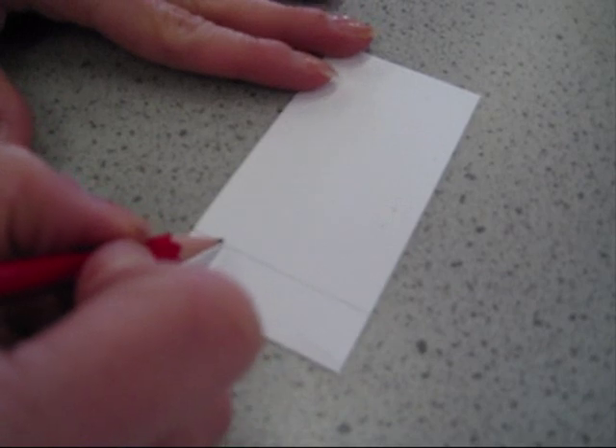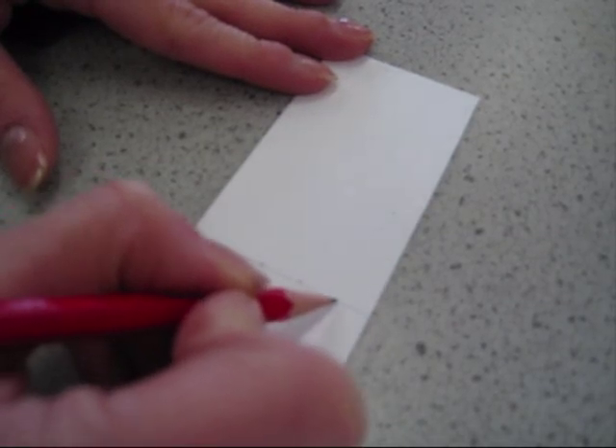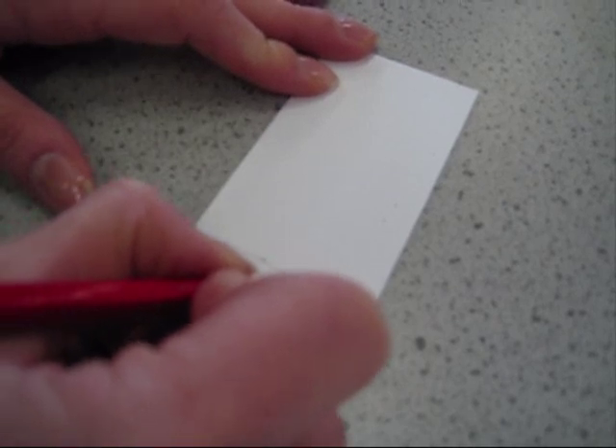We now want to draw on where we are going to spot the substances that we are testing. So with pencil, mark one there — we are putting four on this TLC plate, so space them out fairly evenly. We are also going to label which they are, using the first letter of the substances that we are testing.